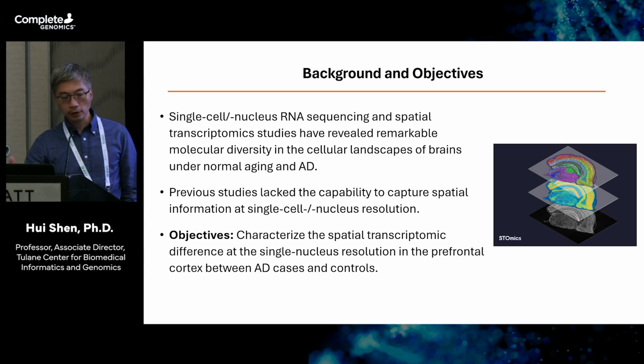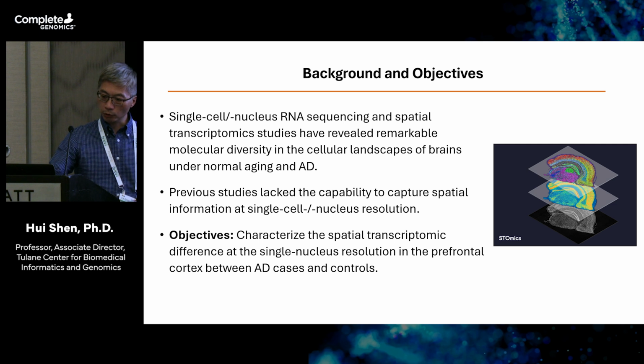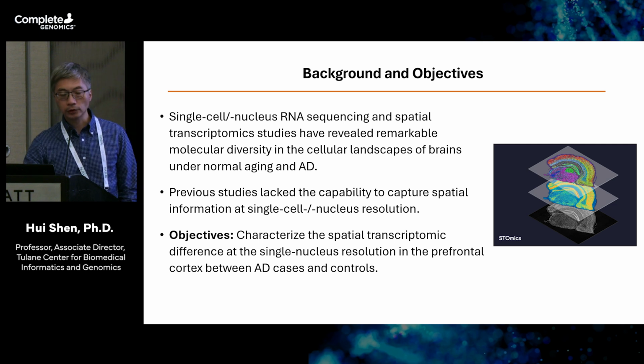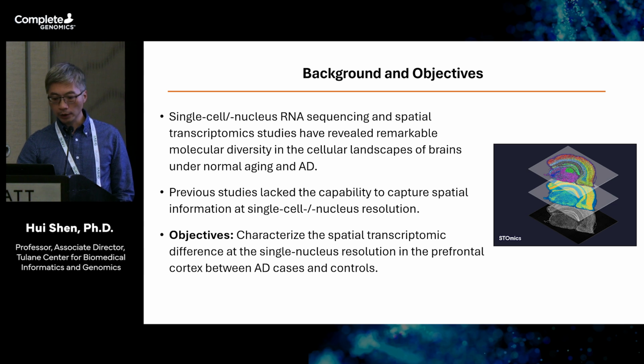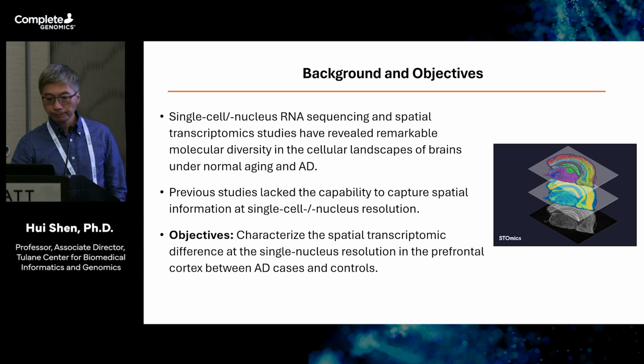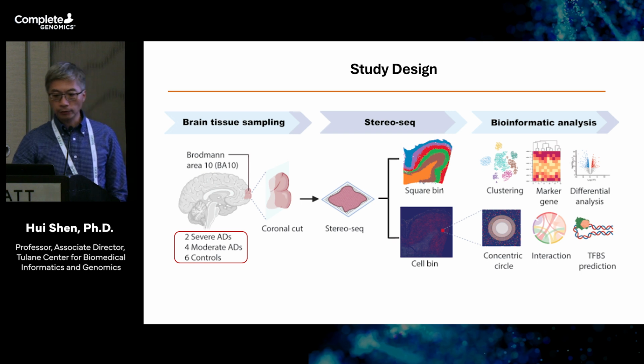So, equipped with the Stereo-seq technology, we carried out a pilot study to characterize the spatial transcriptomic analysis at single-nucleus resolution between the AD cases and controls. This is basically the study flow of this project.